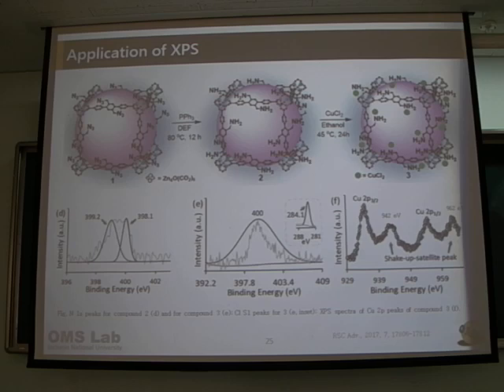So from the TGA, as you said, you have some degradation pattern, and the first pattern, below 100 something, we usually call this water peak and solvent peak. And the second region, let's say ammonium degradation, and then some polymer alcohol degradation. We first assign, and then from each assignment, we can tell how much more ammonium you have. Then of course you will lose more ammonium, right?